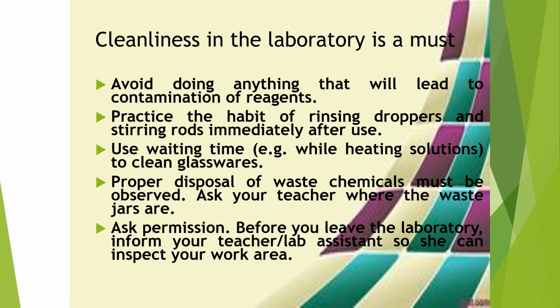Cleanliness in the laboratory is a must. After working in the lab, you clean your workstation. You avoid doing anything that will lead to contamination of reagents. You practice the habit of rinsing droppers and stirring rods immediately after use. You use your waiting time. For example, when you're heating solutions, you clean your glasswares or check your data.